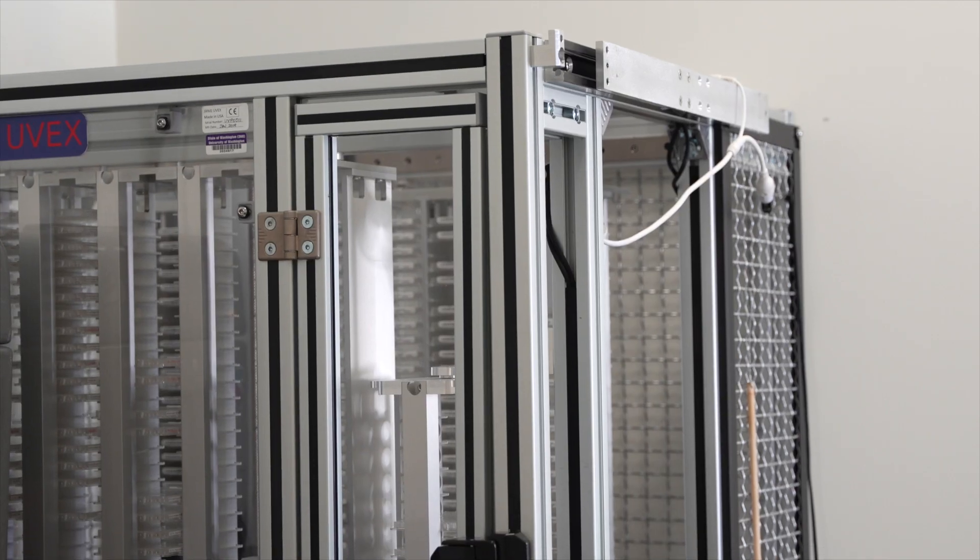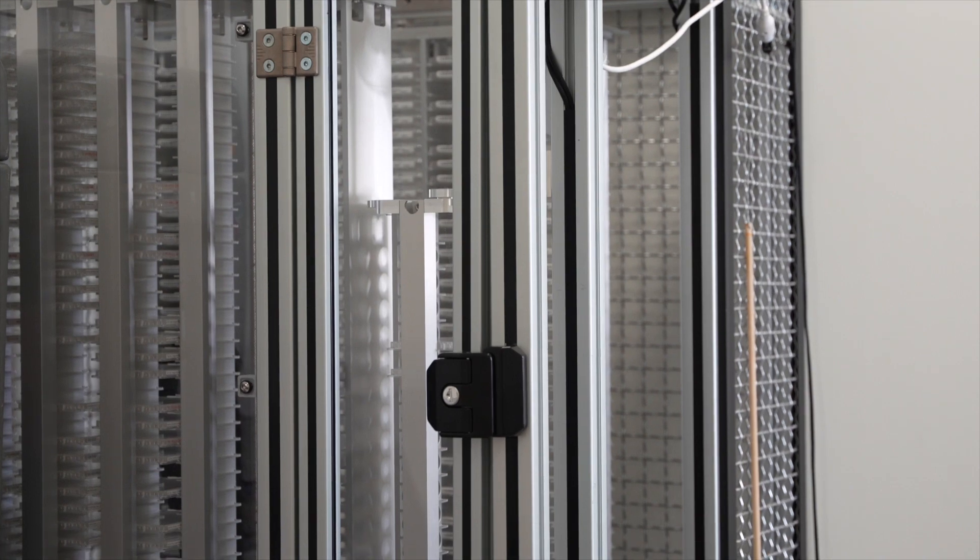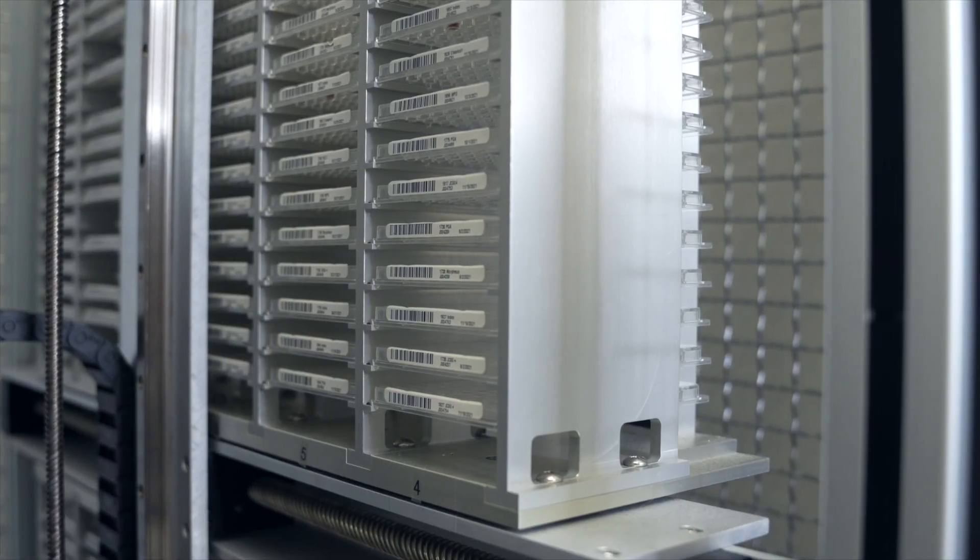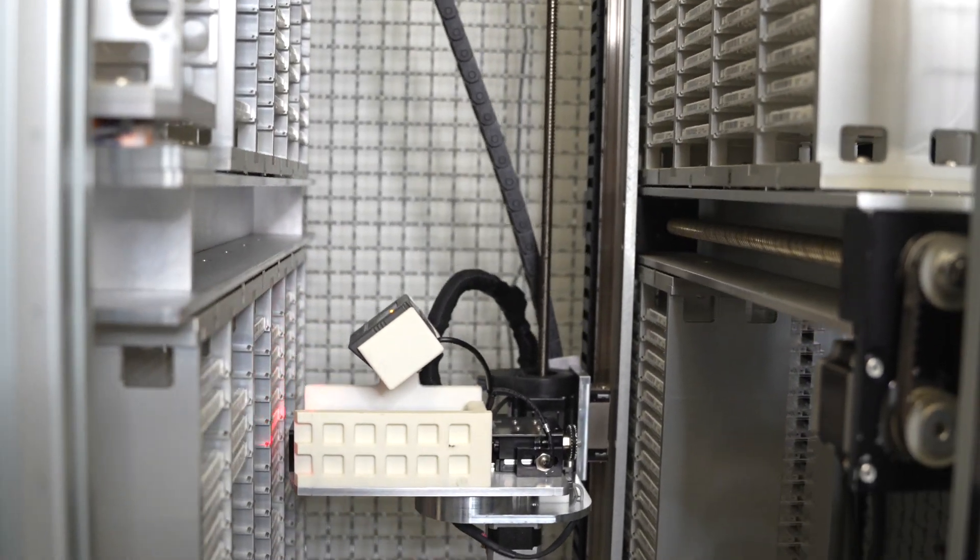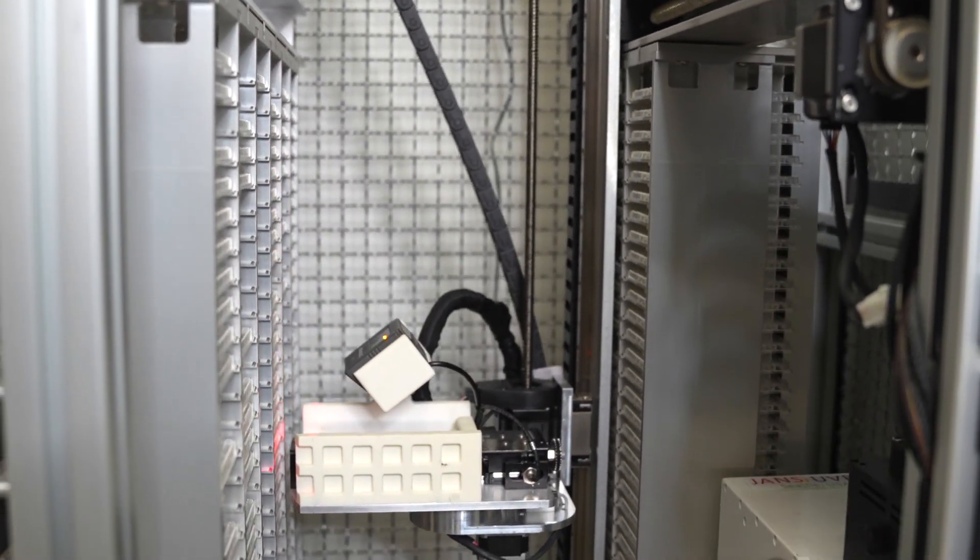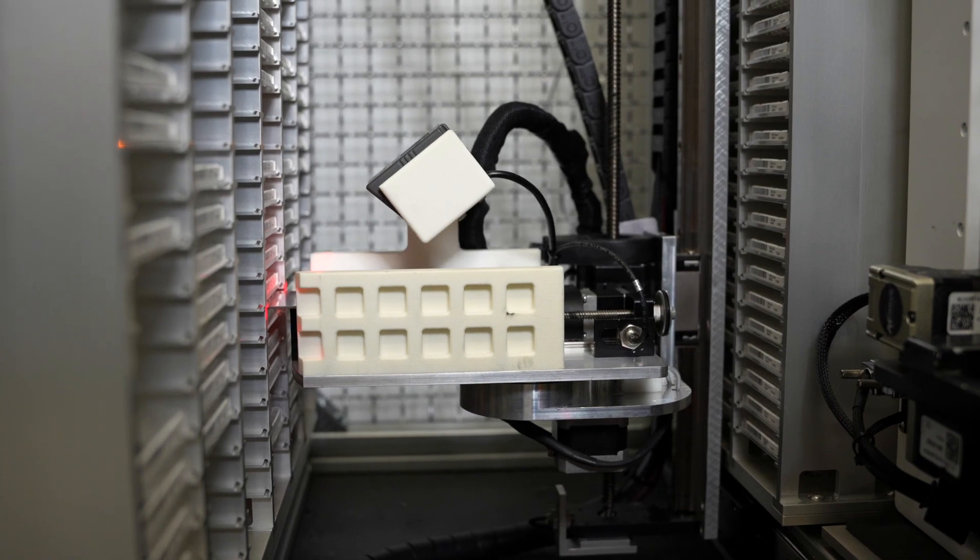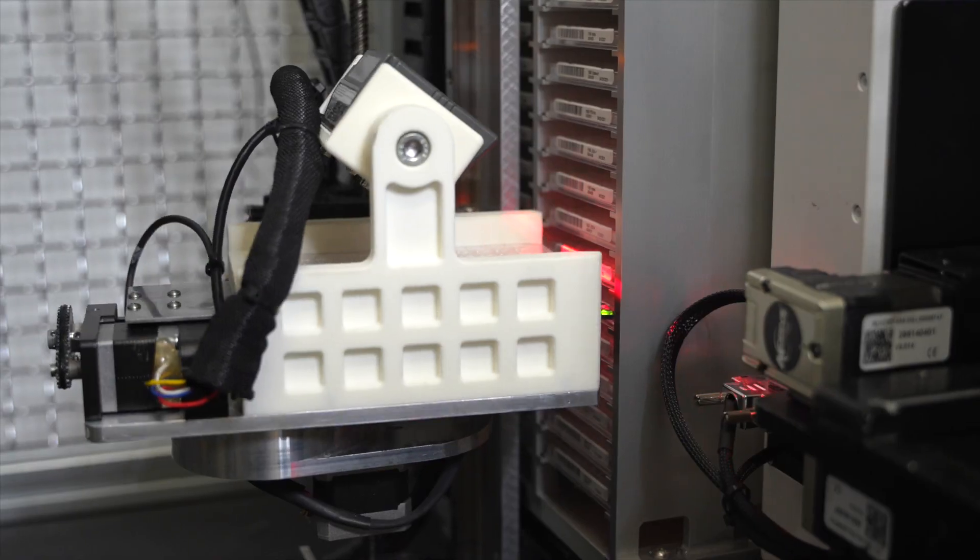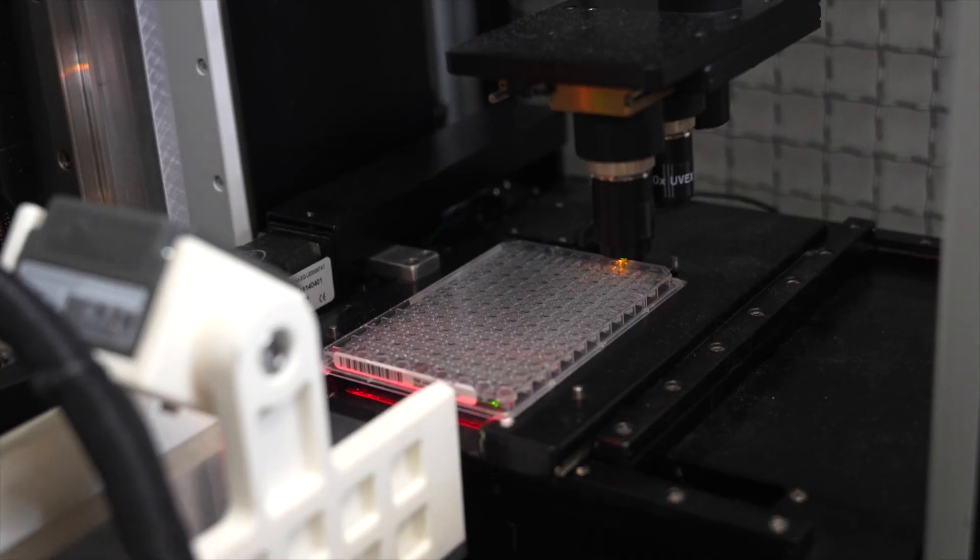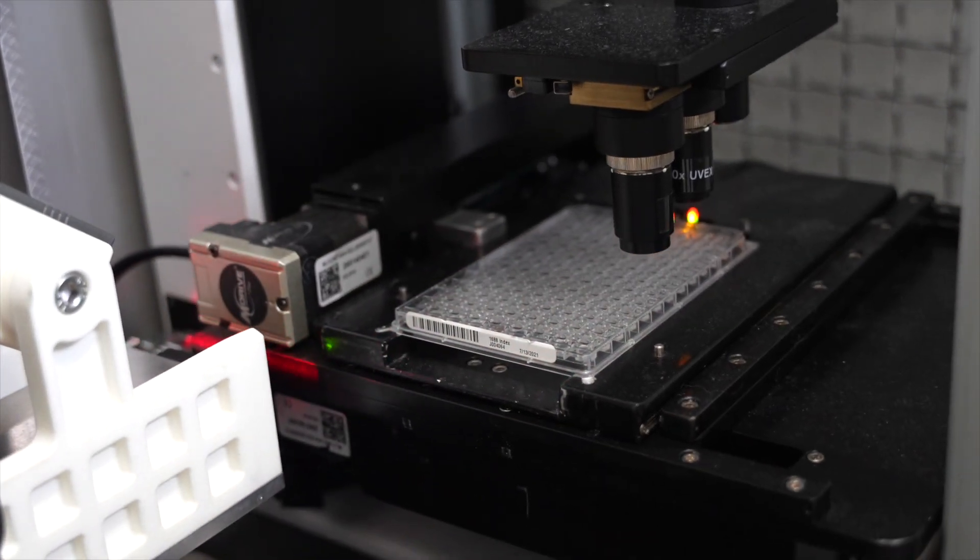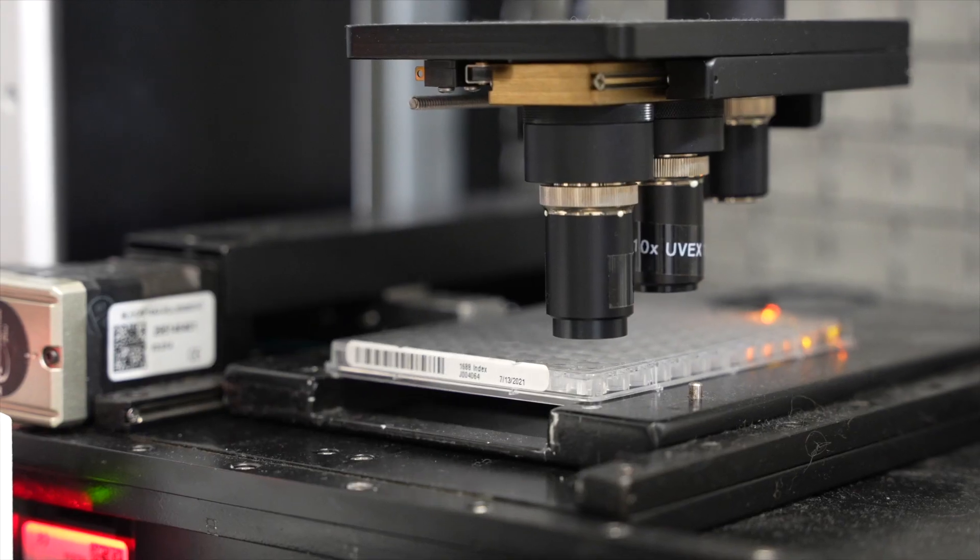We set up a lot of crystallization experiments here at the Institute for Protein Design, and that adds up to a lot of time checking trays for crystals. This robot is a crystal hotel, and it helps us monitor trays automatically. It's hooked up to an imager and a computer, which uses image recognition to detect crystals for us. If we're lucky, we'll find tiny protein crystals. Then we can get them ready to be blasted with some x-rays.